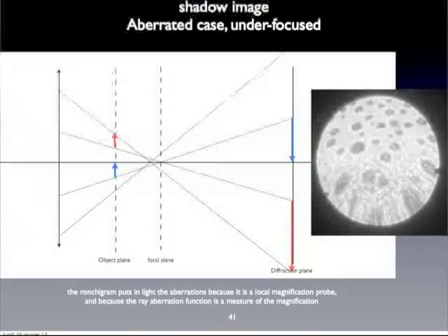So the consequence is that close to the axis you have a given magnification for a given size of the object, and if you keep looking at an object of the same size, but now a little bit off axis, then you will have, in that case, an increase of magnification, right? Okay, so this is exactly what you see here.